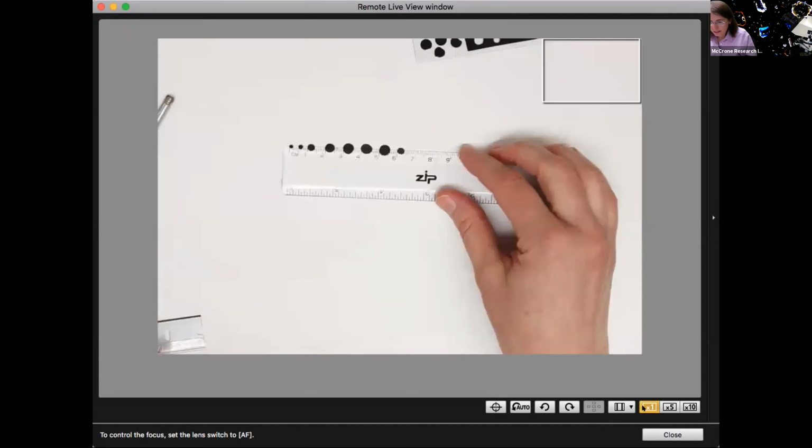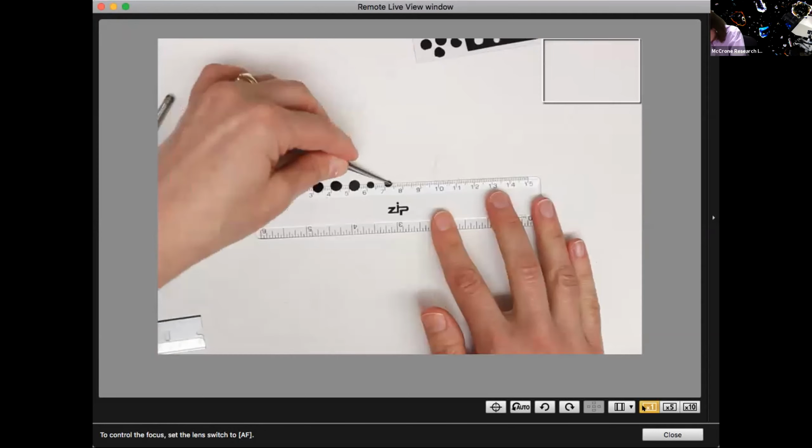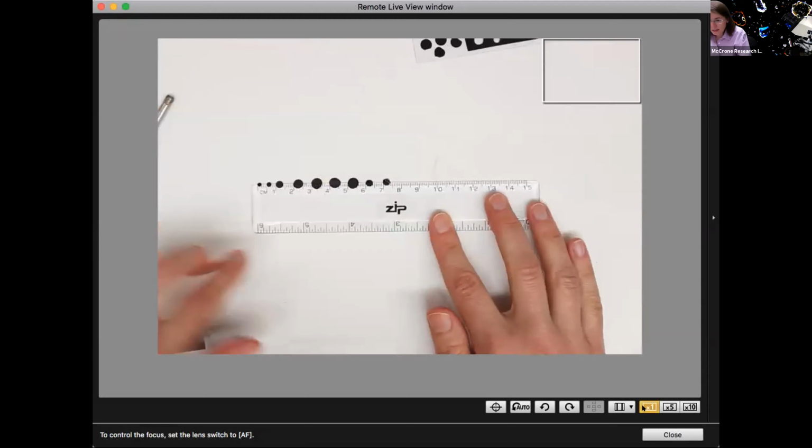What I usually like to keep at hand is a ruler, and I put a whole bunch of different spots on them. And then I'm able to select which size is better. So if we have a look at this one I just cut, I would say it's probably not the prettiest spot that I've ever cut.